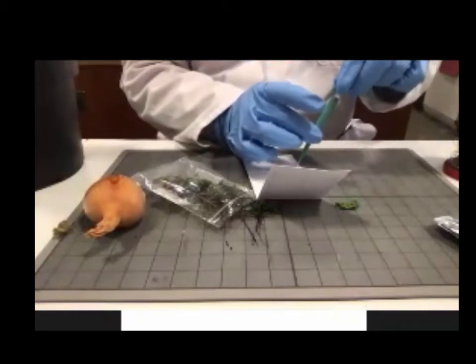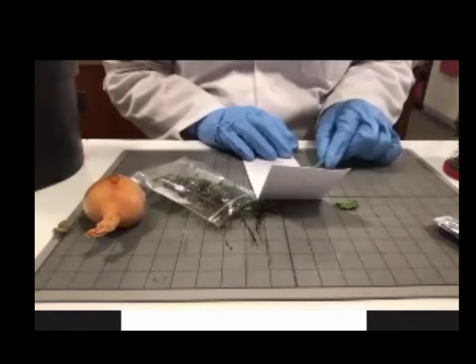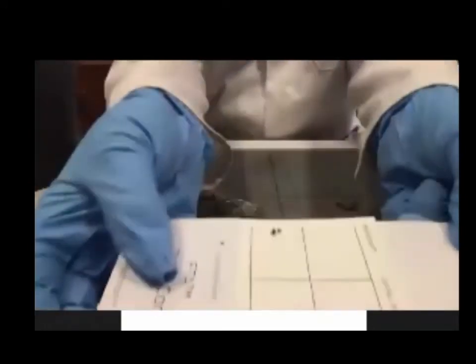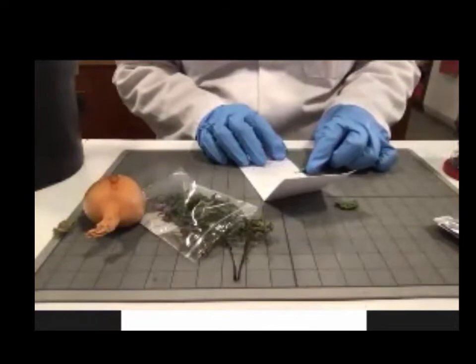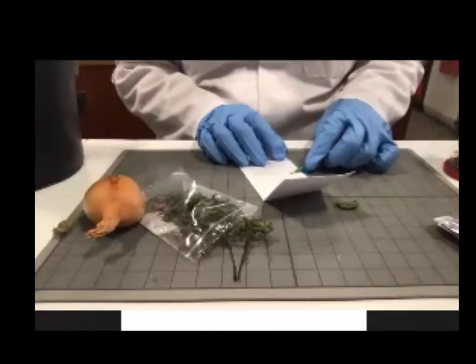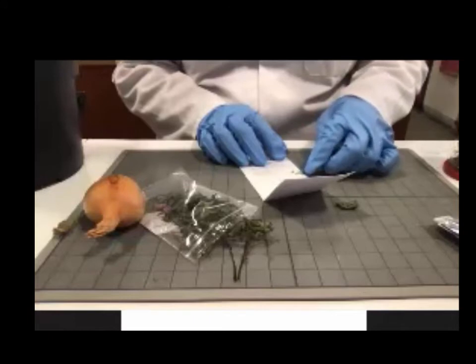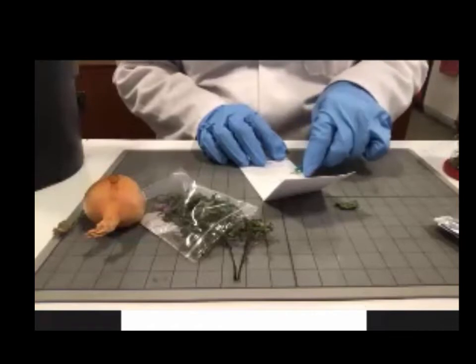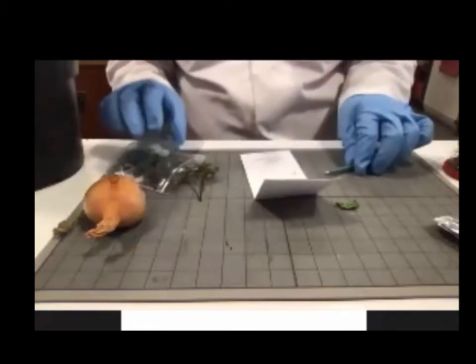Pop it out. There we go, and there are some discs. Can you see those? Little tiny discs of the leaf, and scrunch them onto the impregnated paper. Don't go too hard at it. That's it, that's one. I will just have to change this.